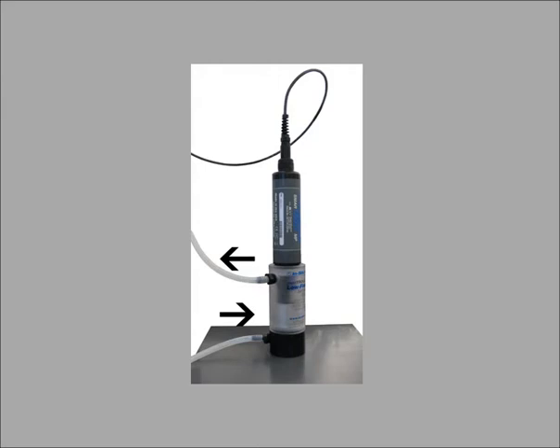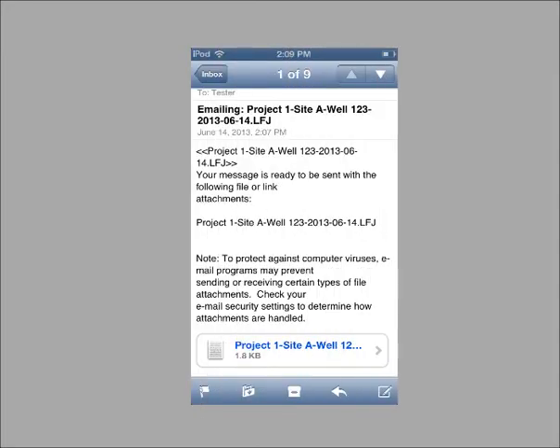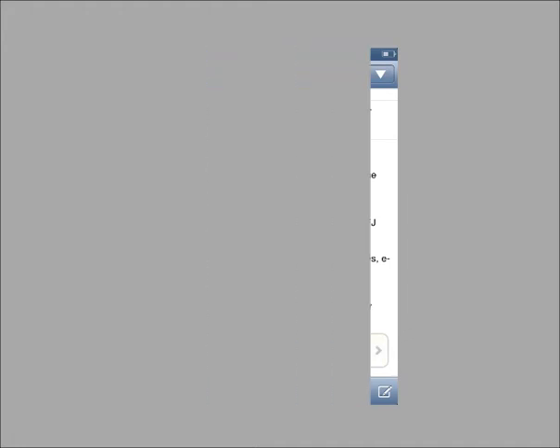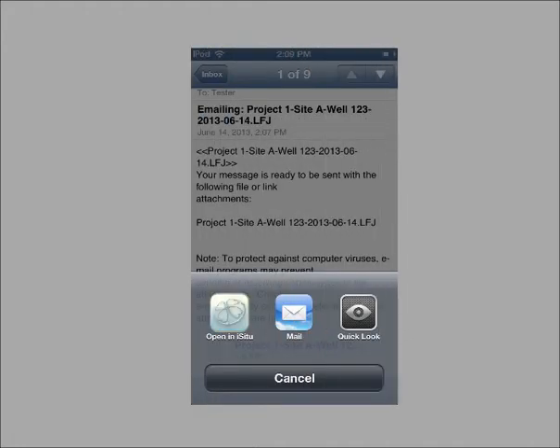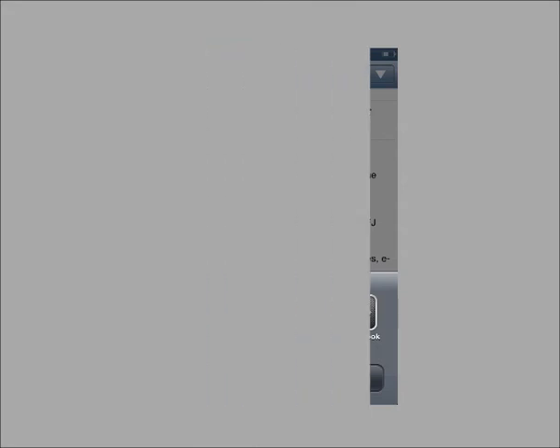Open email on the mobile device and find the message with the template attached. Press and hold the attachment. Tap the iSitu icon. The template loads right into the app.